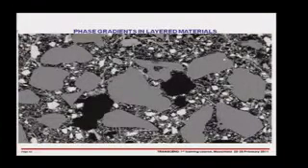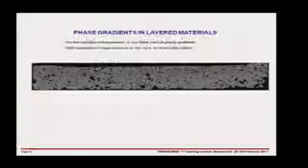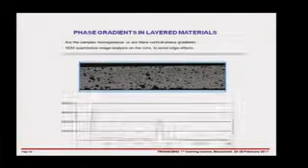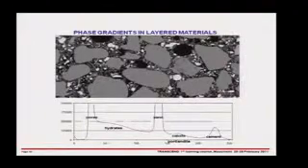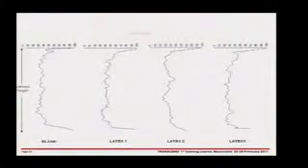You can analyze quite easily your sand, your unreacted cement. You can see that this is a very porous material. This is quite typical of these kinds of applications where you have thin surfaces on the outside of a building. They're actually very, very porous materials. And by looking at different ones here, we can see in the different cases, we can segment the different phases, and we can see how the amounts of those phases vary as we go through the sample.